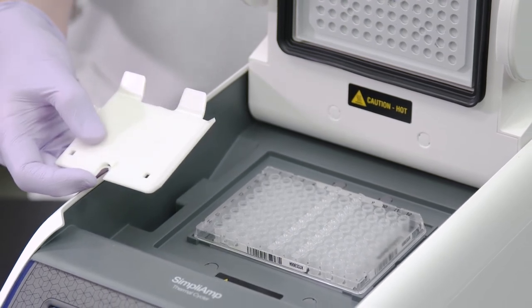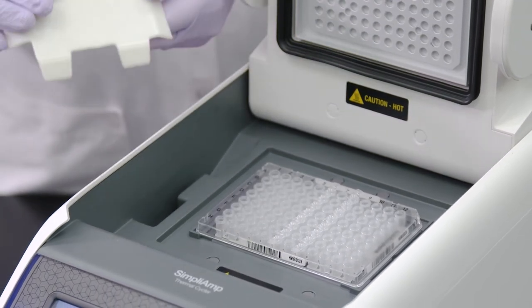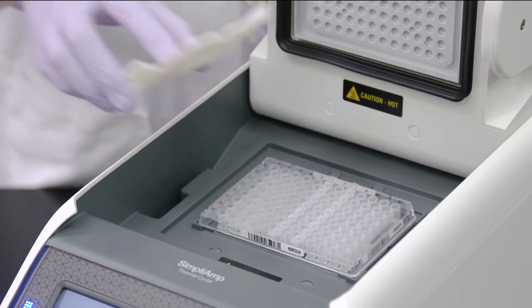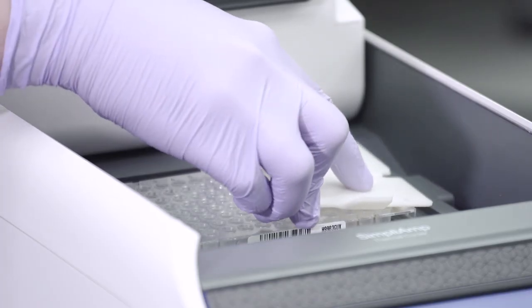To release the plate from the block, insert the two hook protrusions into the short side of the PCR plate and lift to remove the plate from the sample block.